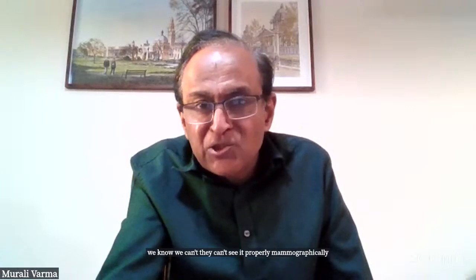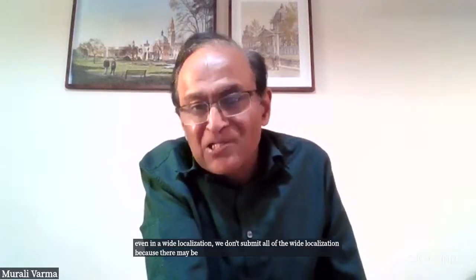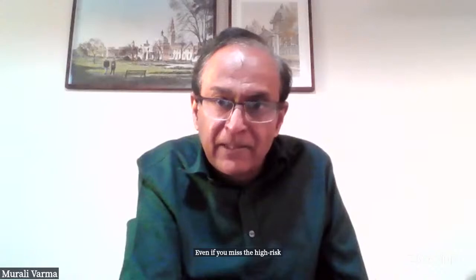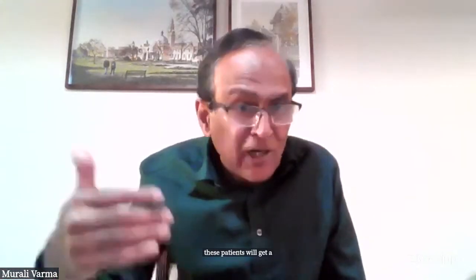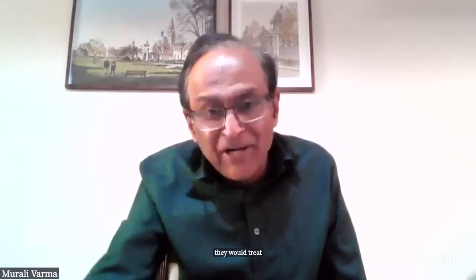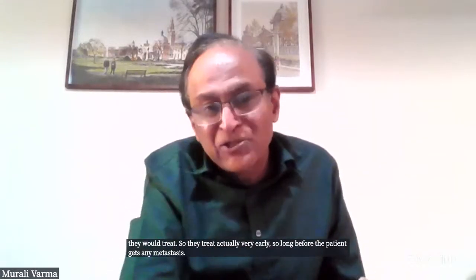Even in a wide local excision, we don't submit all of the wide local excision because there may be an incidental lobular carcinoma somewhere. Forget about the mastectomy. But the other side is, even if you miss the high-risk tumor in the prostate, these patients will get a rising PSA. And today, it's not like the old days where they used to wait for the PSA to go to 1 nanogram per ml. Today, if it goes up to 0.4, they would treat. So they treat actually very early. So long before the patient gets any metastasis, he would get adjuvant therapy.